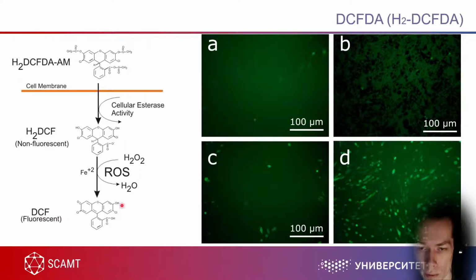So if you have no reactive oxygen species, there will be no fluorescence.